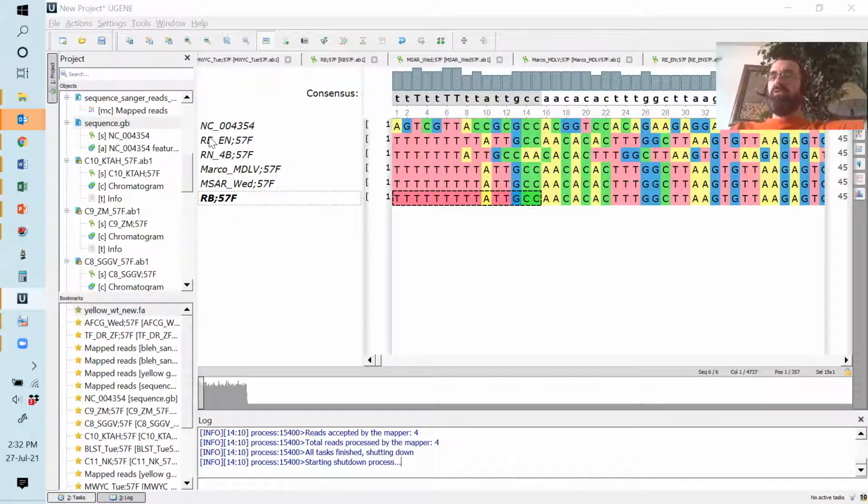But it shouldn't make any difference which ones you've selected. The only thing that's going to be different is whether they have an A or a C at that base 172. That's the only difference, or should be. It obviously depends which ones you pick as to which ones will have the A or the C.